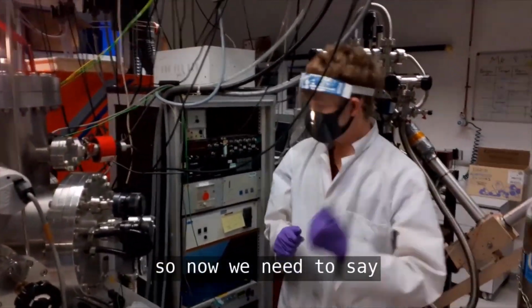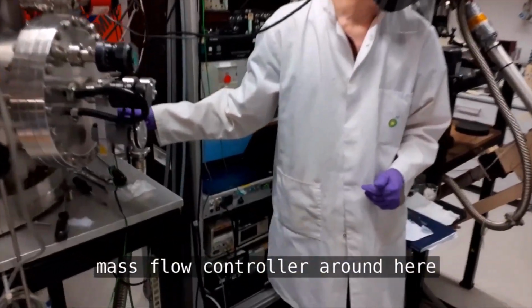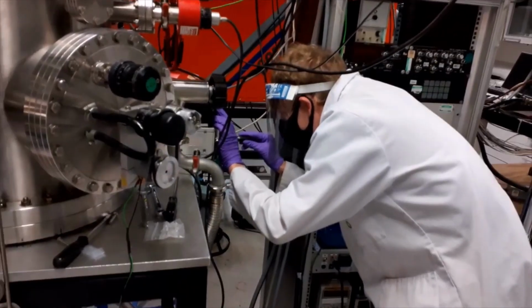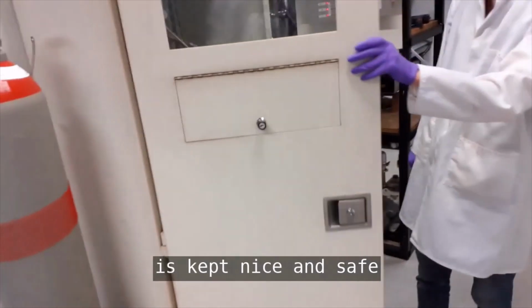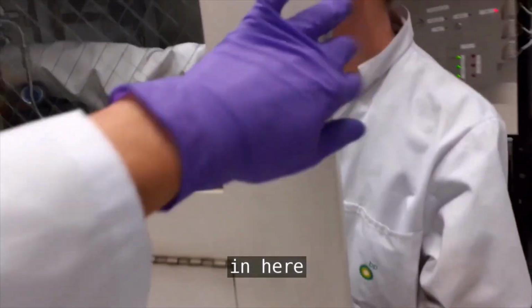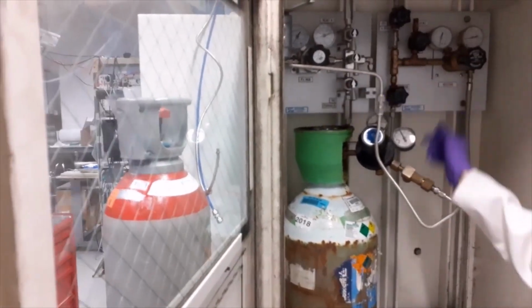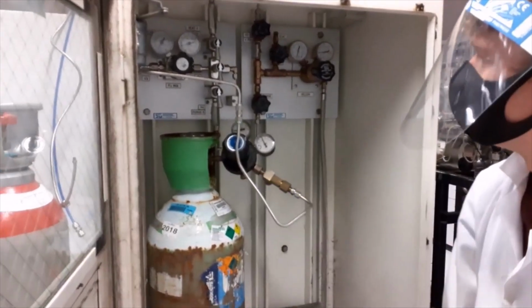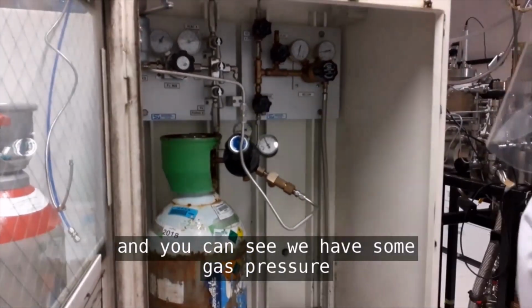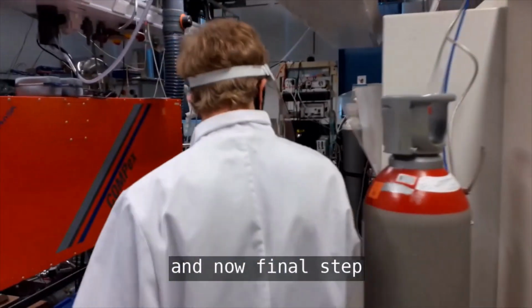So now we need to say what flow rate we actually want. That's done from the mass flow controller around here. The oxygen cylinder, kept nice and safe in here, and we just switch it on at the top there. We'll hear a little hiss, and open again there, and you can see we have some gas pressure. That's all good.